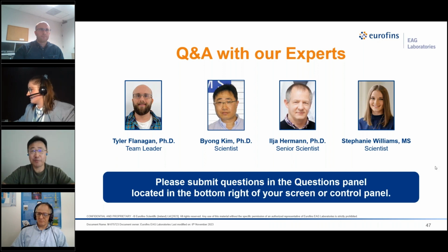Great. Hope that gives you some answer. Ilya, what is the benefit of nanoindentation compared to normal DMA, dynamic mechanical analysis, for mechanical properties measurements?